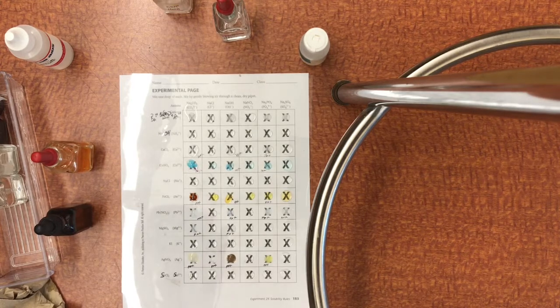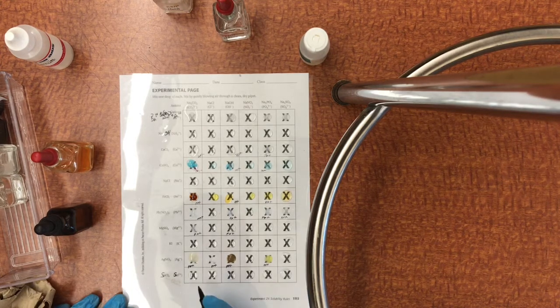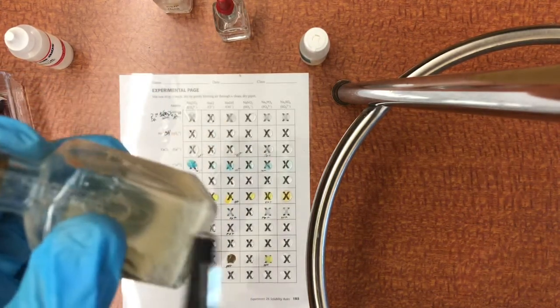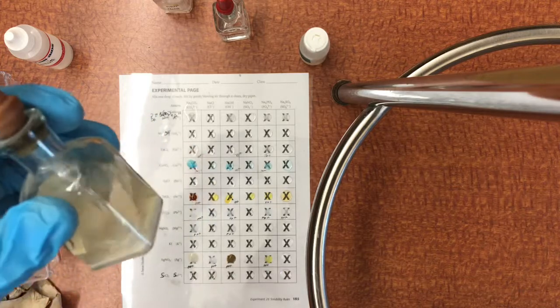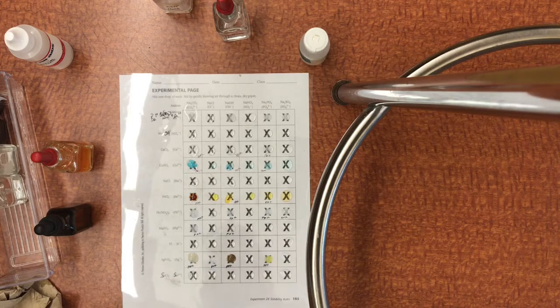So no reaction. Tin is in the same group as lead, but one up from there, and it is soluble. So a little bit of a smaller molecule, maybe has better bonding with oxygen. No reactions. Okay. Surprised about that one, but this one is also a very old solution. So sometimes when the solutions are very old, all the tin might already be out of solution. It might have already formed some sort of solid down at the bottom. So see the white precipitate at the bottom of the solution. So that's one thing to always consider, is making fresh solutions before doing an experiment, just in case.